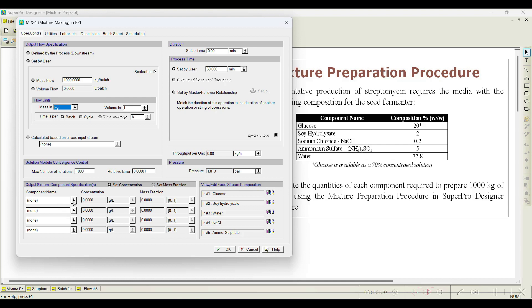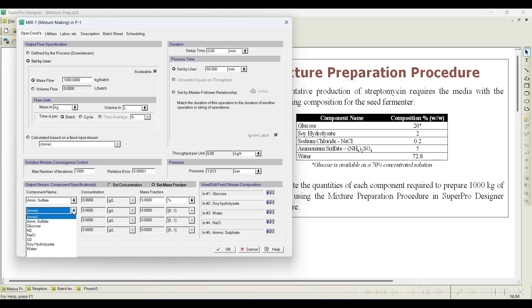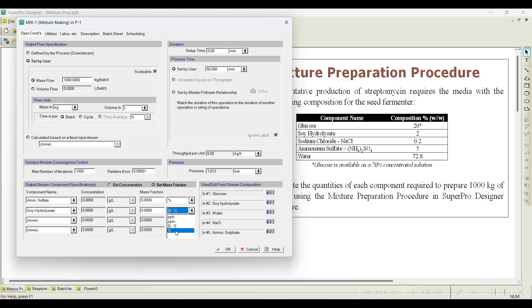Let us fix four components; the software will automatically fix the fifth (water). First, ammonium sulfate — as per the problem statement it is 5% w/w. Change the unit to percentage and enter 5%. Next, soya hydrolysate is 2% — select percentage and enter 2%. Then glucose — set its composition as specified.